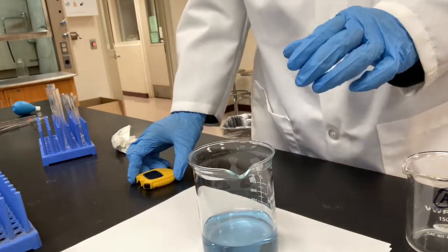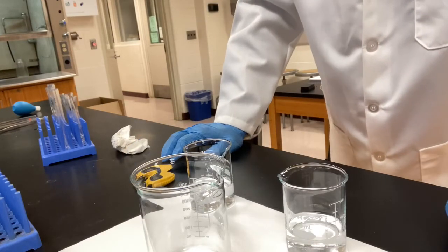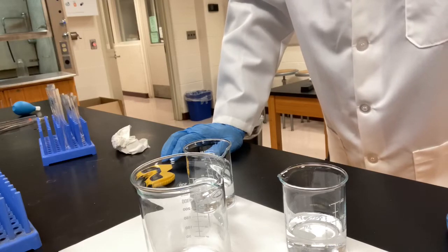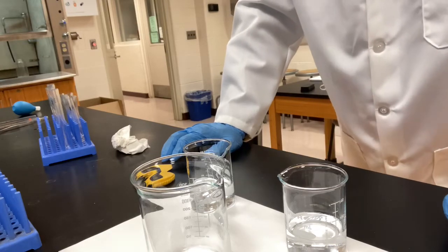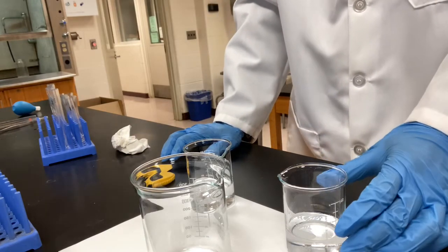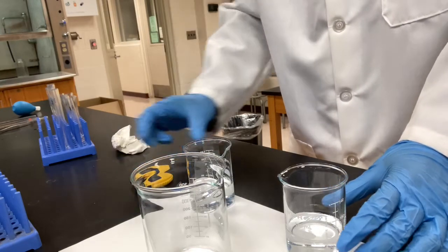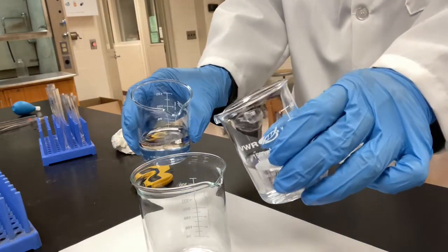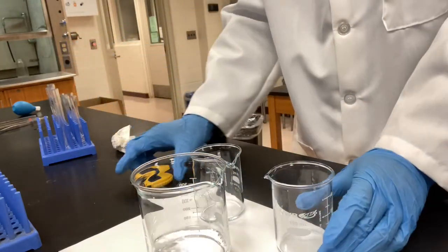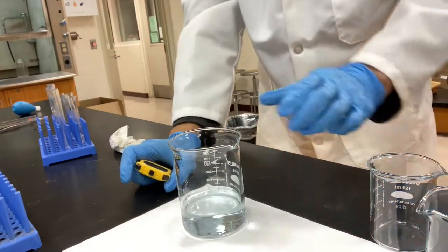Okay, let's move on to trial number 2. The amount of potassium iodate is 4 mL now. 4 milliliters doubles the concentration of potassium iodate in the first trial. I'm going to pour them together and start the stopwatch. Blue.